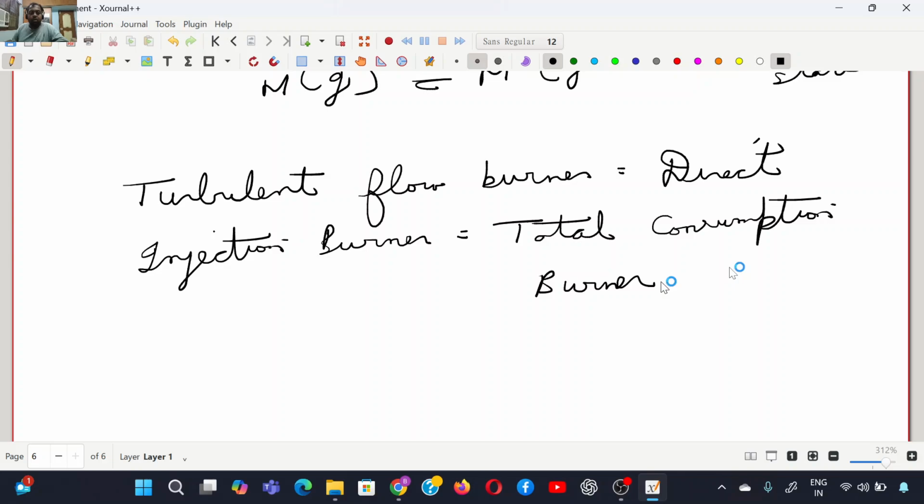So what are the burner design considerations? Burners are usually made from titanium, stainless steel, or other non-corrosive materials. To reduce salt buildup, the burner tip has multiple small holes or slots. Okay. So there is something called the long tube technique, where the flame is directed into a quartz or ceramic tube to increase the optical path length, greatly improving sensitivity. However, this technique is unsuitable for refractory oxides like chromium, tungsten, vanadium, etc., which do not atomize easily. They are best suited for elements like cadmium, zinc, and noble metals.